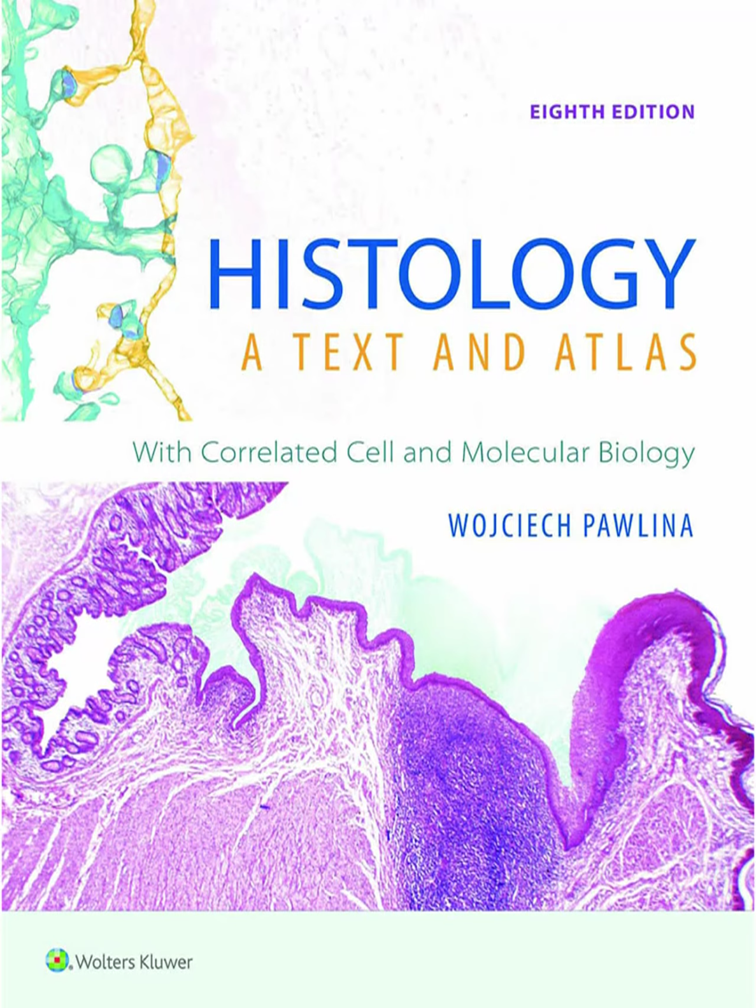And then finally the color, because otherwise it's just a clear slice of wax and tissue, right? You didn't see much. Precisely. You'd see almost nothing. So once it's on the slide, we dissolve out that paraffin wax, and then we rehydrate the section. Back goes the water. Reverse the dehydration. Then it's stained with hematoxylin. Now, this dye is, you can think of it as like a basic positively charged magnet. It's attracted to the negatively charged components in the cell. Like DNA. Exactly. Primarily the phosphate groups in DNA and RNA. So it brilliantly stains cell nuclei, and also areas rich in cytoplasmic RNA, this vivid blue-purple color.